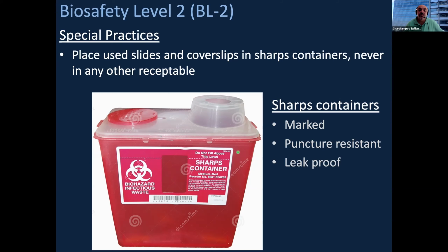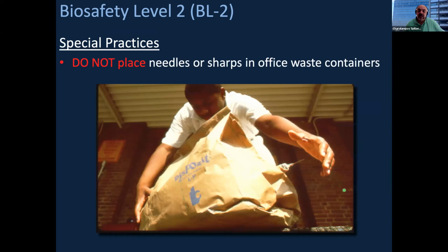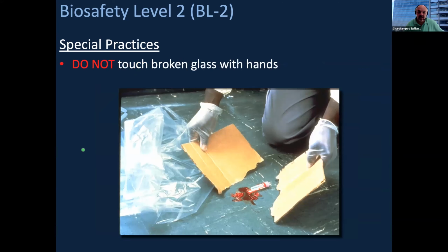They should be disposed before actually the sharps reach the top of the container. There is no way that you're going to put sharps such as needles or even glass slides or any other sharp in the normal office waste containers. This could potentially be dangerous, as I said, to lab supportive personnel.